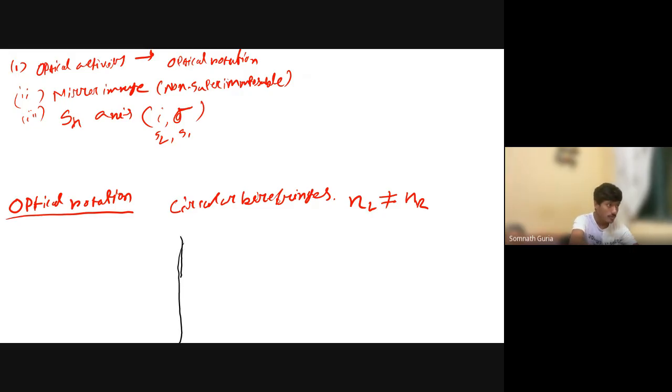This is the lambda wavelength. This is the absorbance.